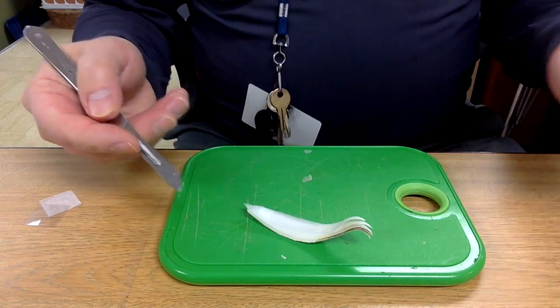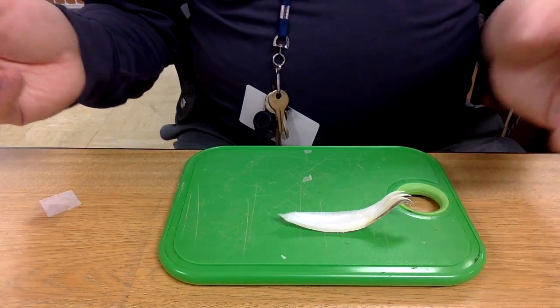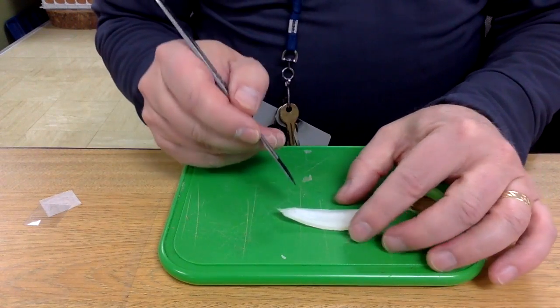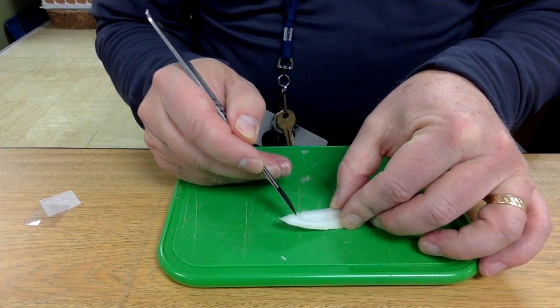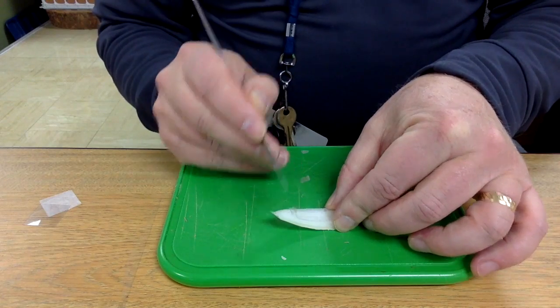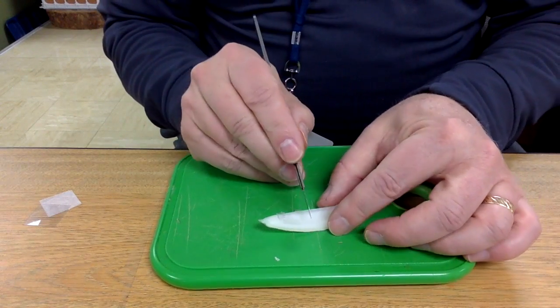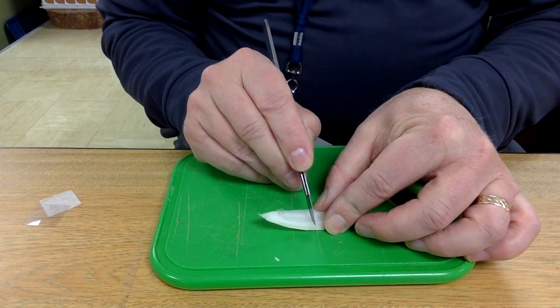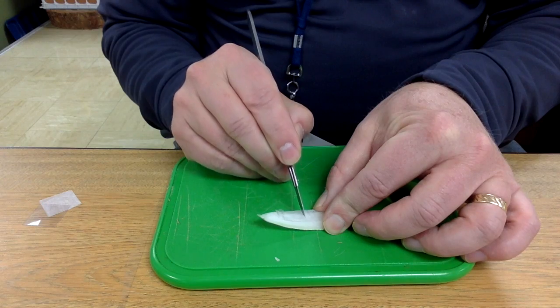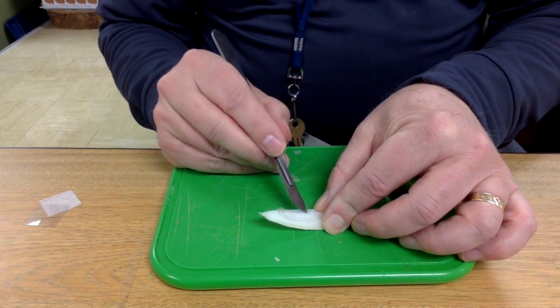The onion comes apart in layers, and each one of these layers is a great spot to grab a sample from. I'm going to peel up this whole part with my scalpel, take a little section, and cut myself a small rectangular piece. Use the tip of the scalpel to help pull that up.